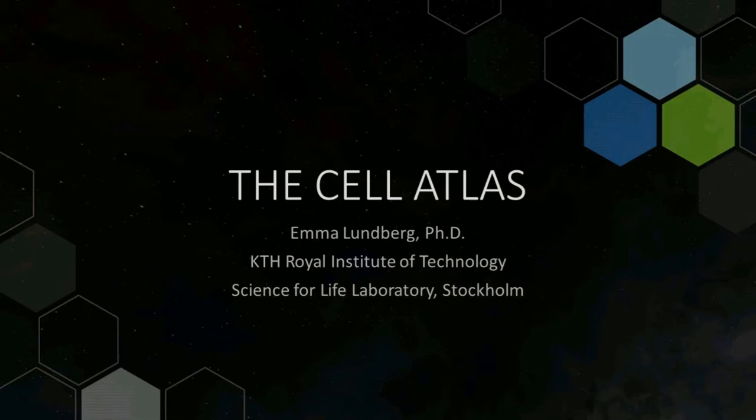To achieve this goal, her lab has developed technology platforms for large-scale immunostaining and systematic validation of antibody specificity, and has initiated citizen science efforts to refine the Human Protein Atlas database. Welcome, Dr. Lundberg, and thank you very much for being on the line today.